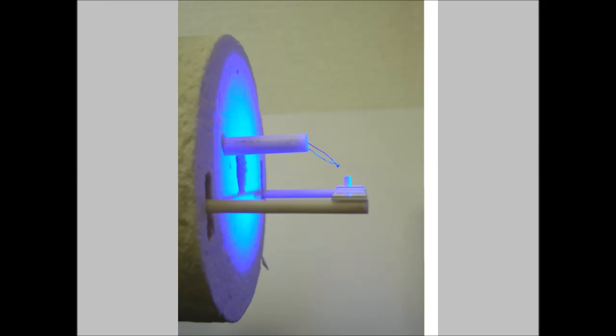The sample is held in place by two refractory rods which are mounted on a motorized micrometric slide. This allows the focusing to be controlled by a software function. The zoom functions are controlled by software as well.